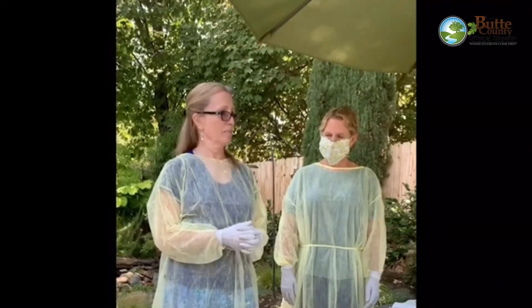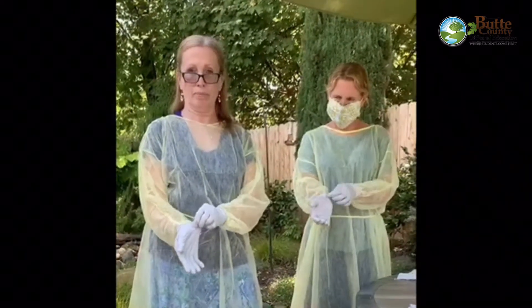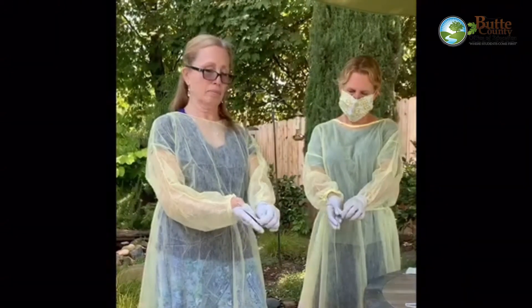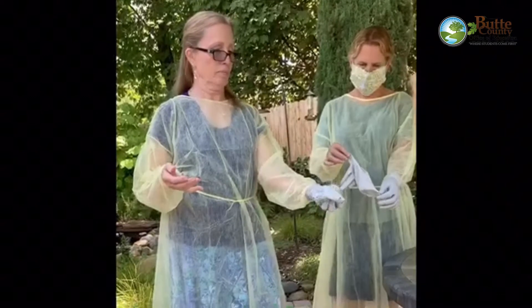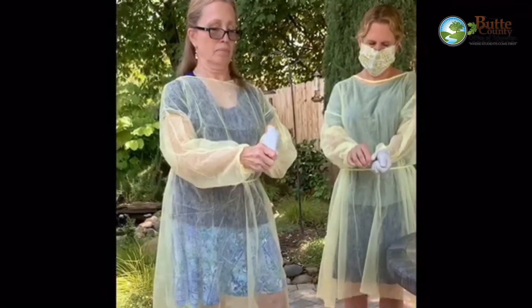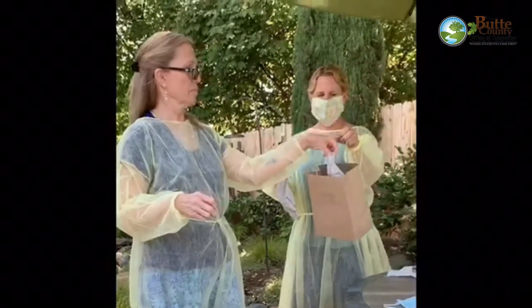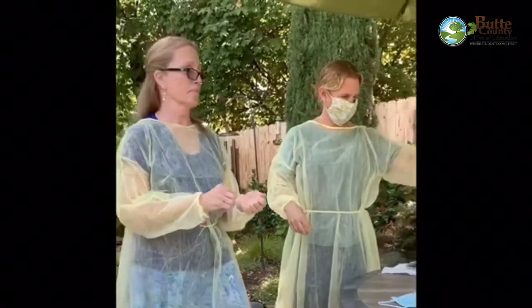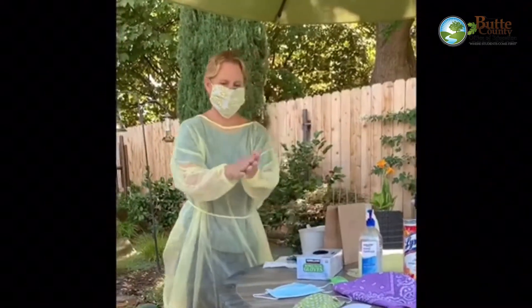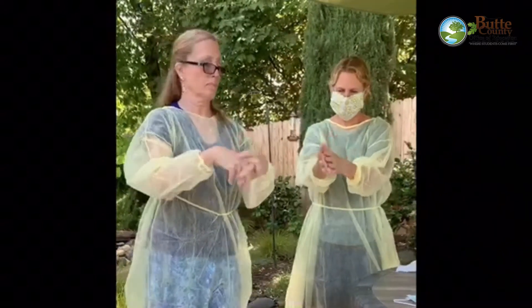Gloves can be removed by more than one technique, but we are going to show you the glove-in-glove technique, which we find the easiest and safest. One, pinch the outside of the glove near the wrist. Two, peel downwards, pulling the glove inside out. Three, with your ungloved hand, slide your finger under the wrist of the remaining glove. Four, again peel downwards, turning the glove inside out. Five, discard the gloves. Six, wash hands with soap and water for 20 seconds or use an alcohol-based hand sanitizer. Be sure to clean your wrists where the edges of the gloves were located. Seven, gloves should be removed and hand hygiene performed before removing a face covering.